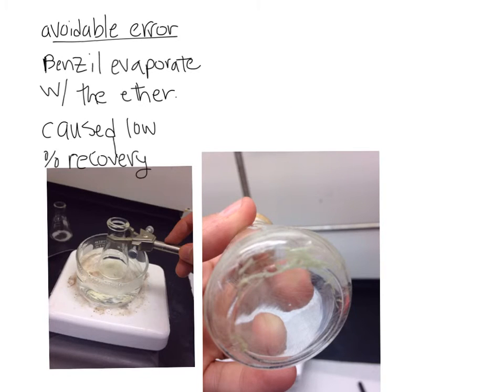And then here, as you see, we evaporated the ether, and then we collected our precipitate, and in my case it was benzil, and it was like crystals. And then one of my huge mistakes is that, since I know that ether evaporates really fast, I overheated it, so I evaporated my unknown along with the ether.